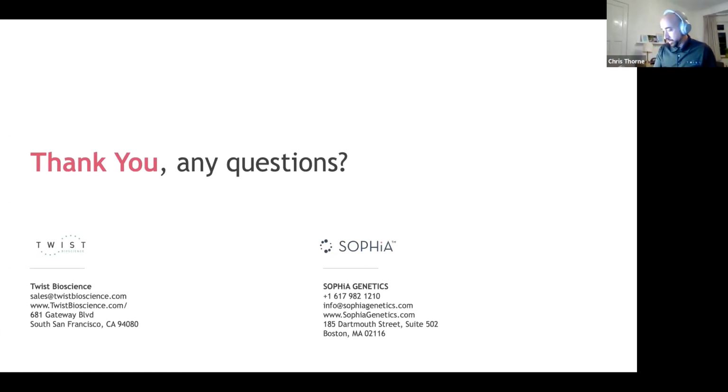Okay. We are coming up on time, but as we've got a few more questions, I'm just going to carry on a little bit. I hope that's all right with you guys. Just a couple of slightly technical questions. So from an anonymous attendee, do you follow standard VCF formatting for reporting CNV calling? So we're actually expanding the way we look at our CNV annotation, and we're constantly changing our platform to meet the needs of the market. So right now we have different ways to take the CNV data out of the platform, in addition to the reporting format that SOPHiA provides.